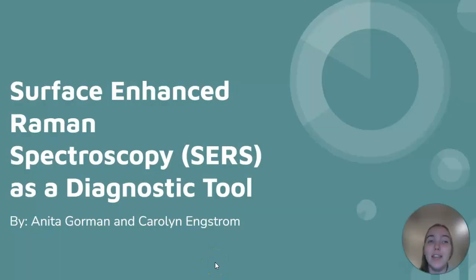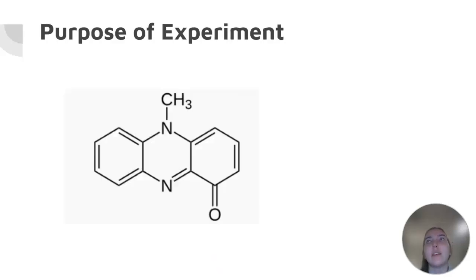Carolyn and I will be presenting today on Surface-Enhanced Raman Spectroscopy as a diagnostic tool. One of the reasons that this experiment has real-world applications right now is because normal diagnostic processes take a long time to tell someone that they have a disease. And this was obviously a really big issue when we were going through the COVID-19 pandemic. If your diagnostic process, like when they were using PCR tests, takes a long time, then it can increase the spread of disease. So there's a real need to look for ways to decrease that process.